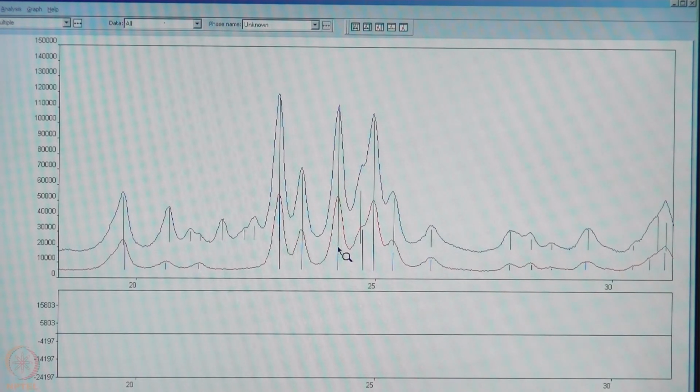that if we have forgotten to put the K beta filter, that is the nickel filter for copper radiation, we will get additional peaks. And then if we treat these peaks without knowing that they are from K beta, any indexing software will fail to index this powder pattern. So, the presence of a K beta filter in all diffractometers is essential, and we must not forget to put that.